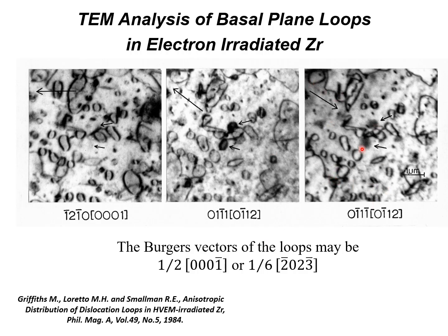They're kind of fuzzy. They're on the basal plane. There's stronger contrast here with this diffracting vector, and you have this residual contrast in this particular case with [bar 1 2 bar 1]. You can see these two lines of residual contrast.